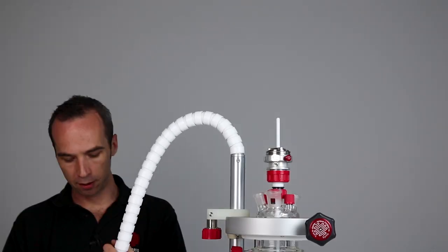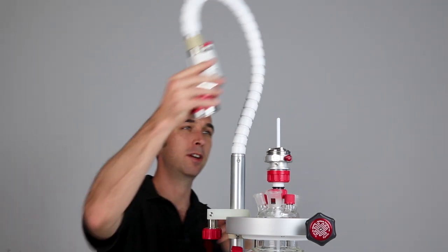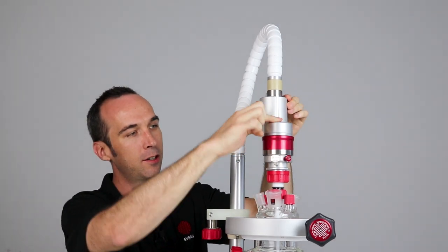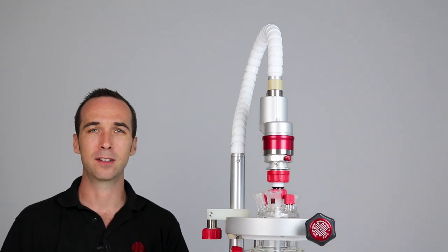Our self-aligning stir-sealing guide and motor allow you to focus on your chemistry rather than worrying about aligning your stirrer. Simply attach the stirrer to the stirrer sealing guide for a perfectly aligned stirrer every time.